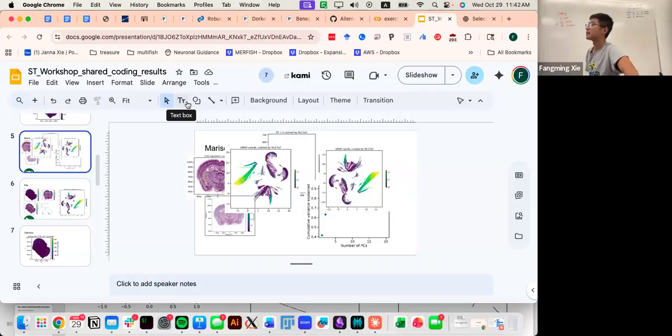Quick question, sort of going back to the PCs. Are we running a PCA to then inform the UMAP? Yeah, you can do that. That's actually what people usually do. The thing about UMAP is that it's too slow and has too many dimensions, so you reduce it first and then run UMAP on the reduced data. You produce a recipe that's both efficient and powerful. Okay, gotcha, just making sure that's what we're doing.